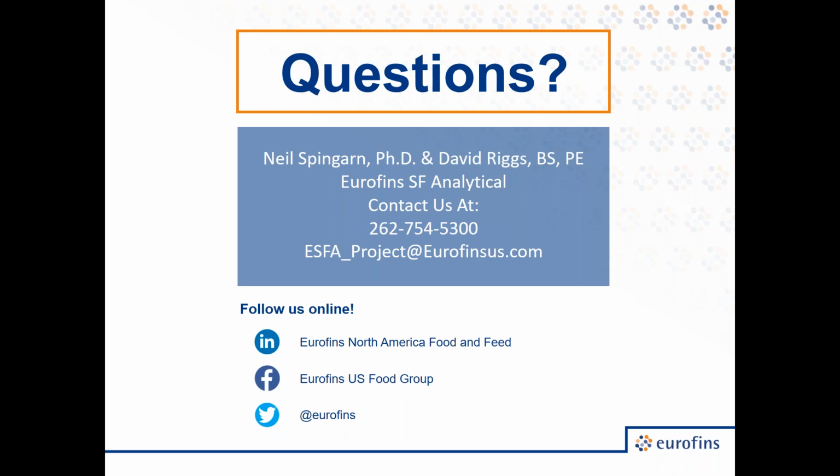So I'll go ahead and take that one, folks. There's a variety of industry guidance, whether it's from USDA or FDA. It's more rigorous for pharmaceutical or infant formula products, but in general, particles in the range of 2 to 7 millimeters are what catch people's attention. But there can be instances where particles as small as 0.1 millimeter can cause a problem, or could be subject to regulatory concern, depending on what it is. So there isn't a one size fits all.